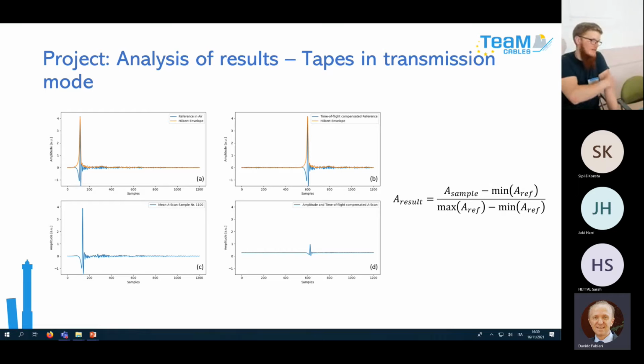First, to at least decrease the error bars a bit, we did two things. First, we moved all the peaks to one value, because sometimes, because of the terahertz device or because of the measurement, you had these peaks of the maximum shifted a bit to the left, a bit to the right.